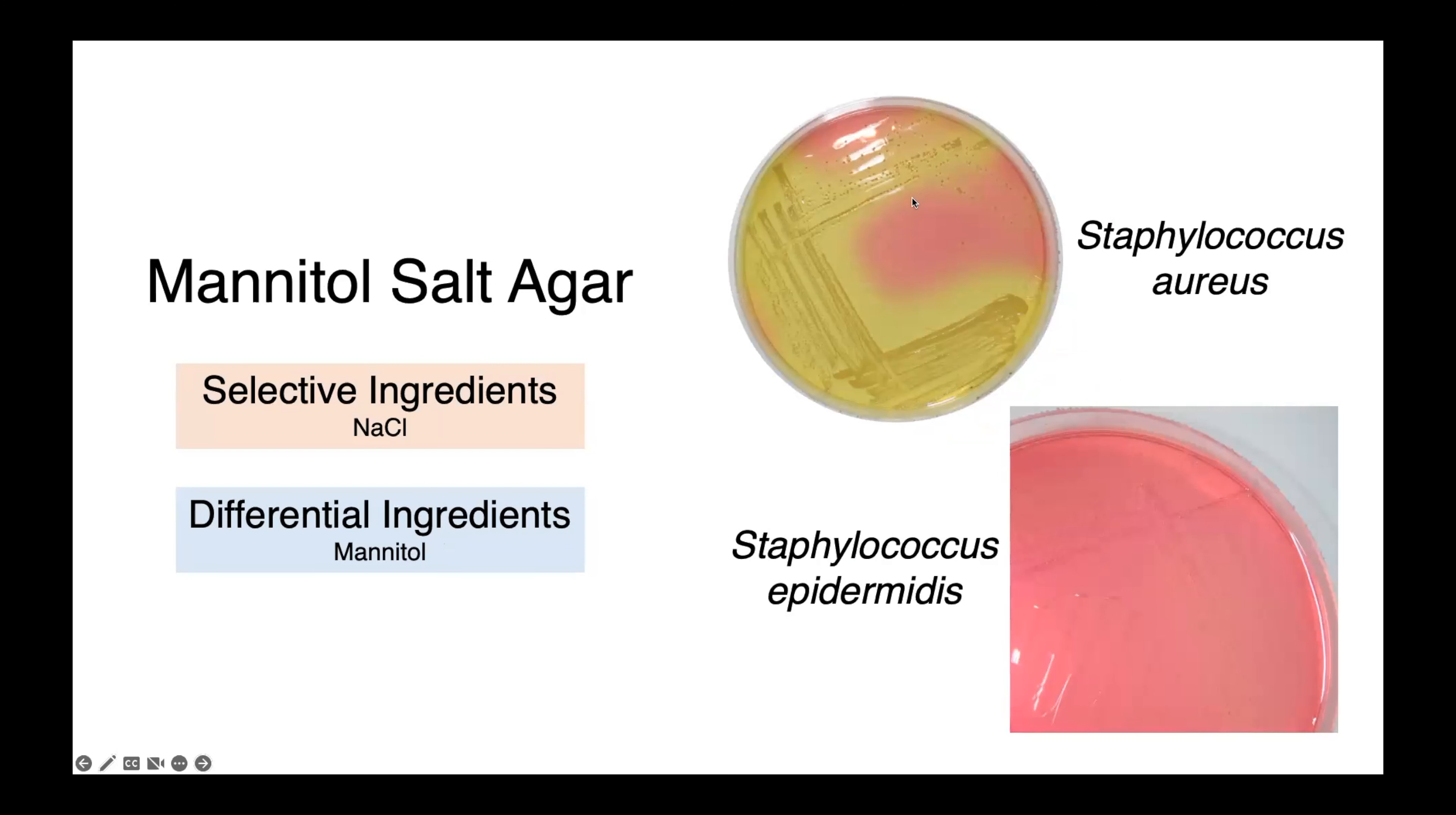On the top, you can see Staphylococcus aureus producing these nice bright yellow colonies. And on the bottom, we have non-mannitol fermenting Staphylococcus epidermidis.